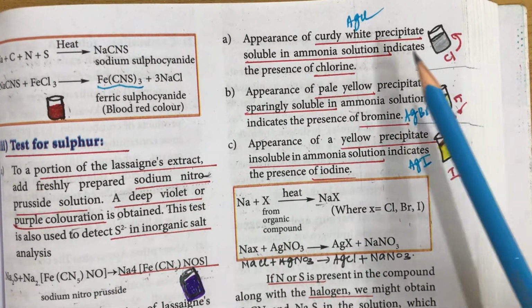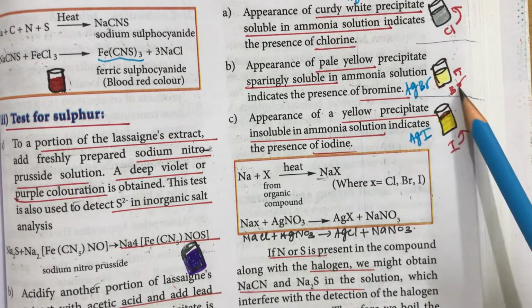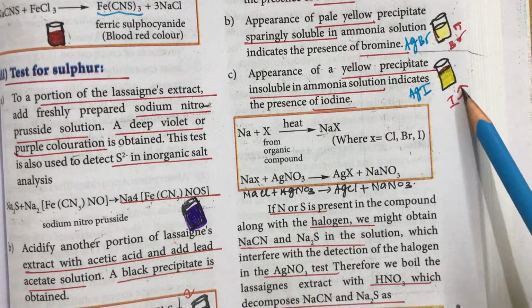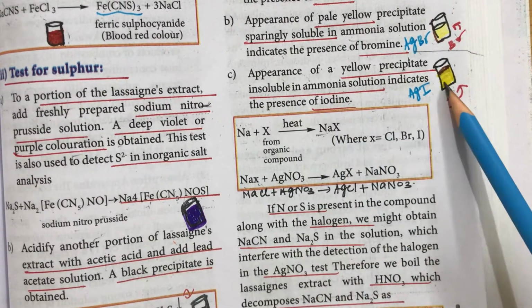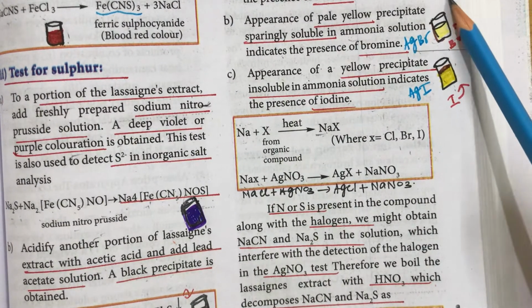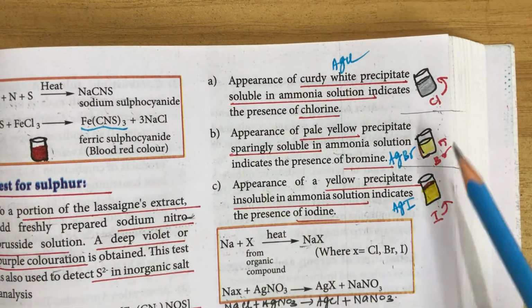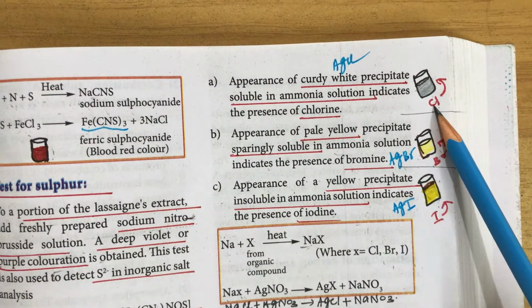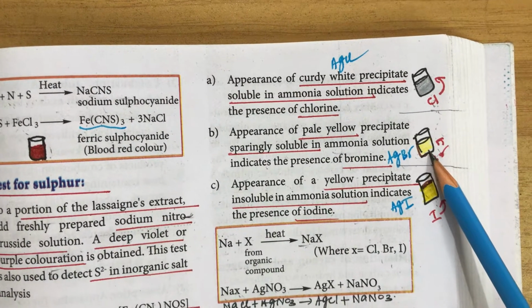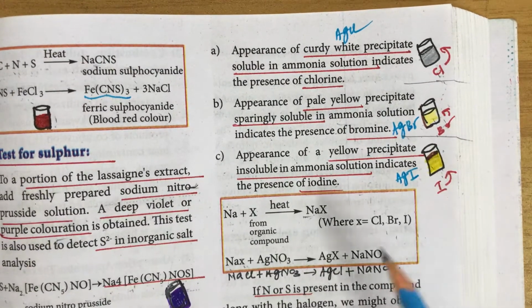For chlorine, the white precipitate is soluble in ammonia solution. For bromine, the pale yellow precipitate is sparingly soluble in ammonia solution. For iodine, it is insoluble in ammonia solution. Why is it silver chloride? Why is it pale yellow? The white precipitate is silver chloride, the pale yellow precipitate is silver bromide, and the yellow precipitate is silver iodide.